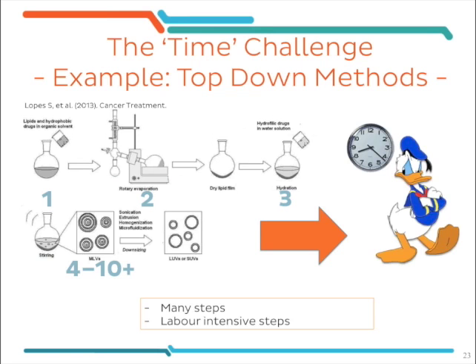And while I just named 4 steps in this process, only the particle size reducing part can involve up to 10 iterations. So all in all, this process is extremely time consuming, especially because each one of these steps is very labor intensive.